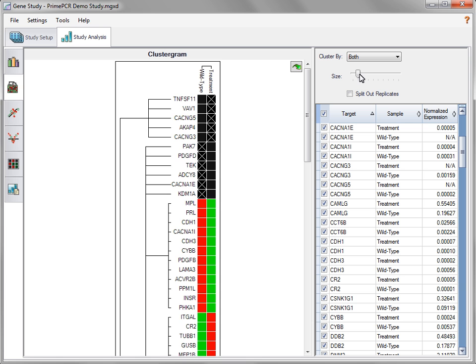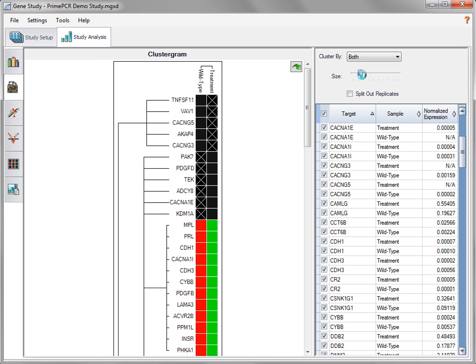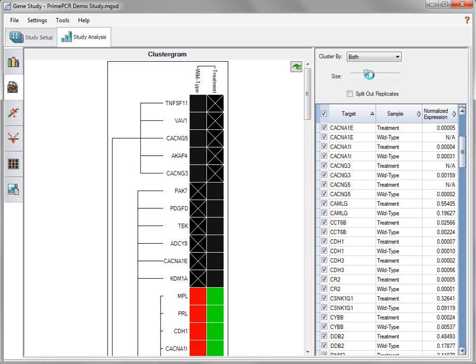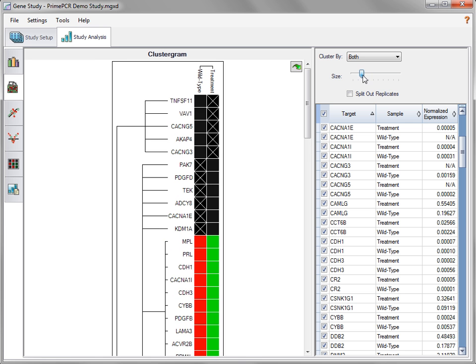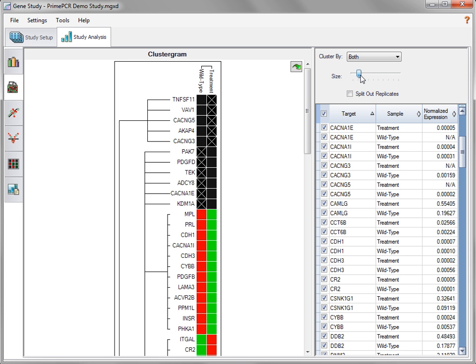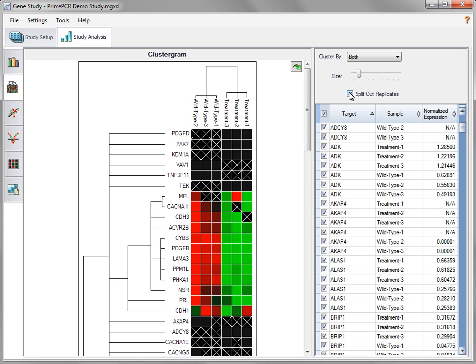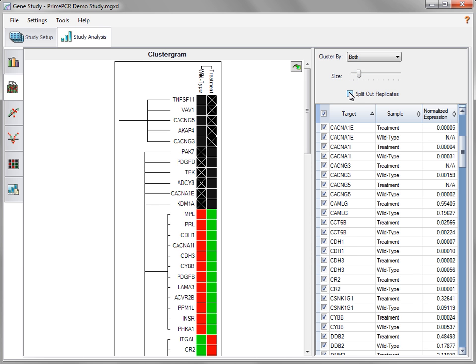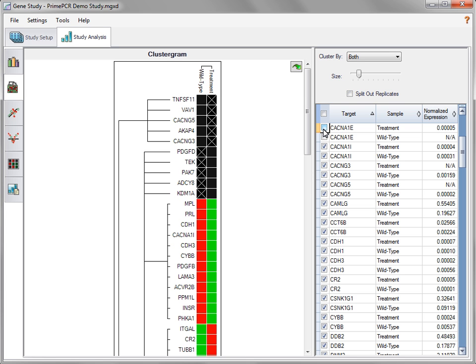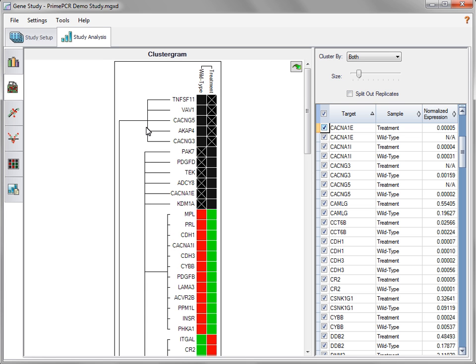Click and drag the slider to adjust the size of the clustergram. The values displayed are averages of replicates. Click this box to split out the replicates. Click the appropriate box in the left-hand column of the spreadsheet to deselect targets.